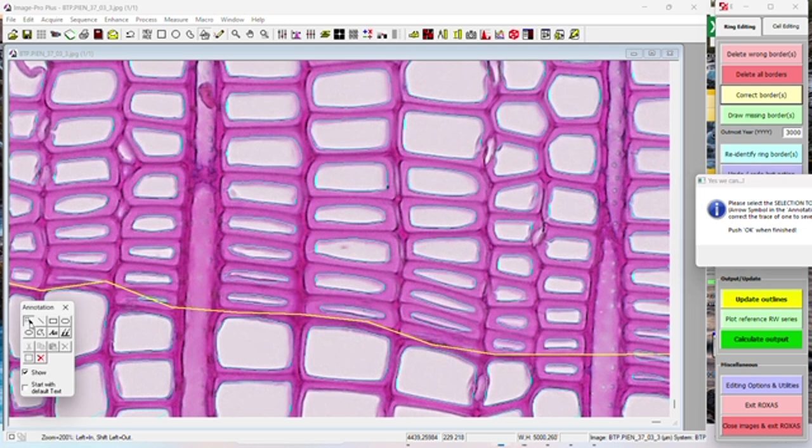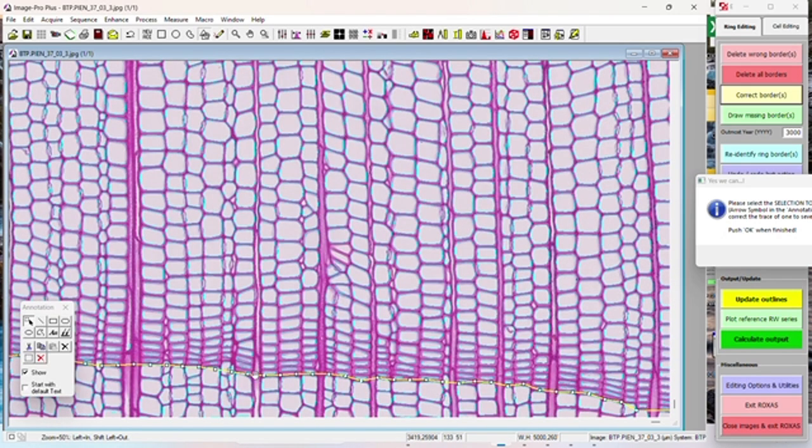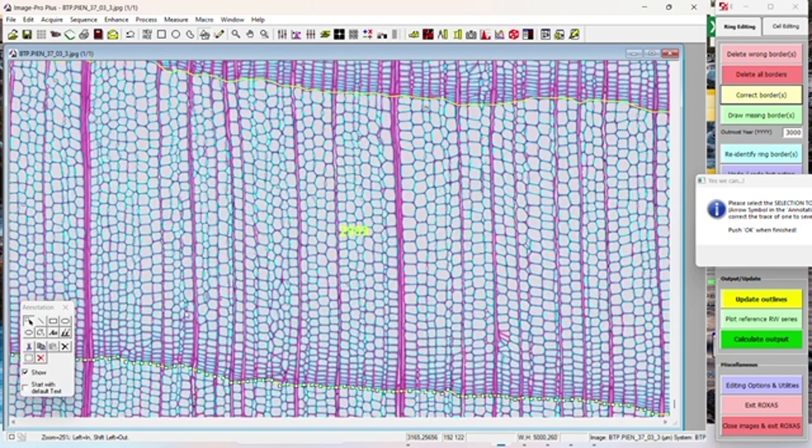And then click on the pointer tool, and then click on the ring boundary that you want to edit. You'll see crosshairs, and that is to just edit that singular point. If you see the hand, it means you move the whole ring boundary. So to get to this point over here and correct it, I have to move this whole ring boundary in. Just be careful when you're doing that, that you know where to put it back. Otherwise that could get awkward, like what I'm dealing with right now. Well, that looks about right. And maybe zoom out to make sure there aren't any issues here. And this one can be brought up so that those cells aren't included.